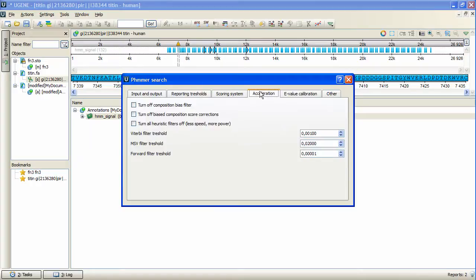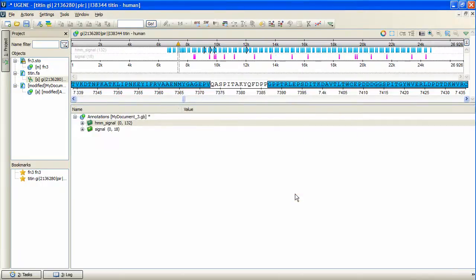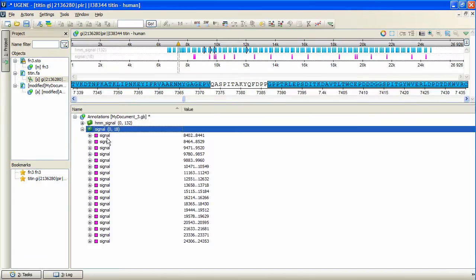When adjusting is done, we go back to the Input & Output tab and press Search. As always, the found results are represented by annotations.